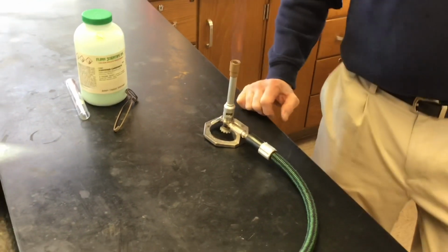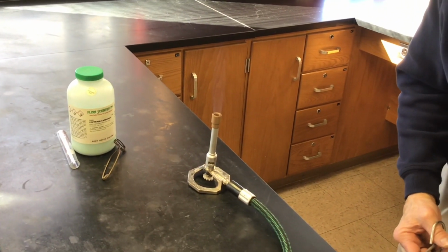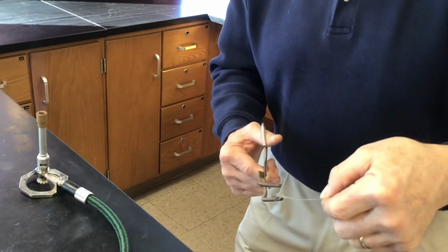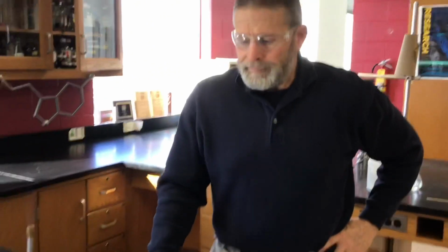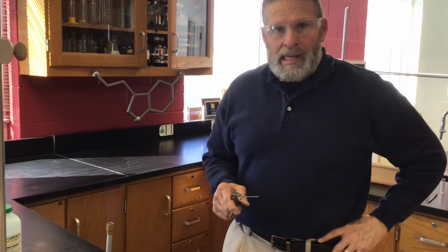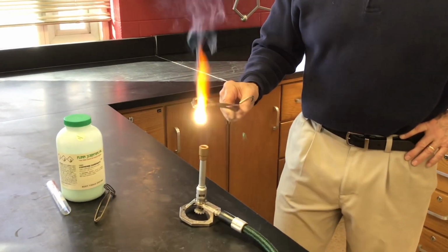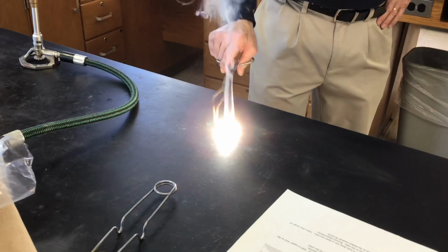Should we go for it? Let's see if it'll light the magnesium. It might not. Okay, here is our magnesium metal. You may remember it from the empirical formula lab. It's the exact same reaction. We're starting with just magnesium here, and of course, recognize it's reacting with the oxygen in the air. We're hoping this burner will get hot enough. Oh, it looks like it. There it goes. And it's bright. Such a good flame and reaction.